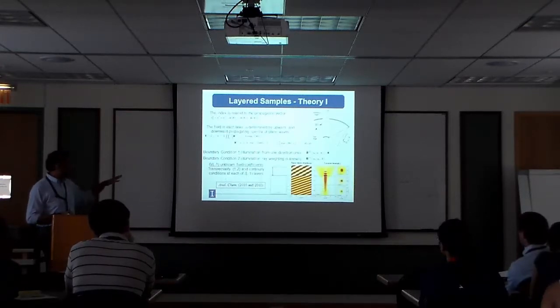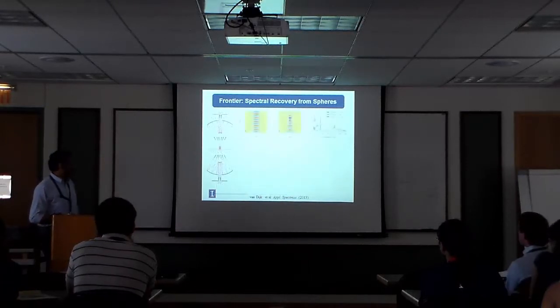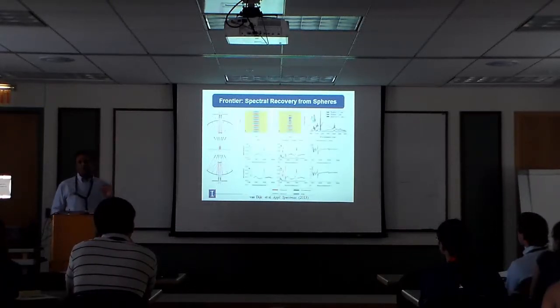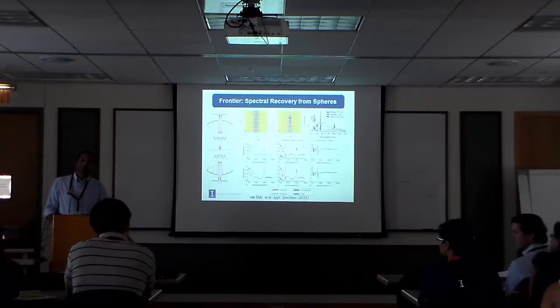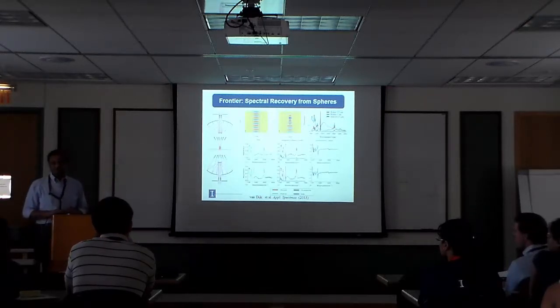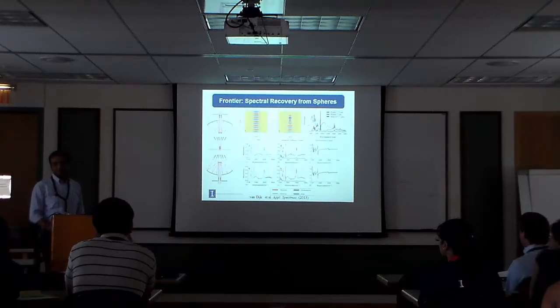Okay? So I think did Scott cover this properly? Anyway, let me bring you to the results, right? So what we've been able to do is take, yeah. So then take the transmission function of the, other than the optical transfer function of the system? Yeah, let me clarify this point, right? So it's not the physics-related optical transmission function. Right? It's not the physics function.